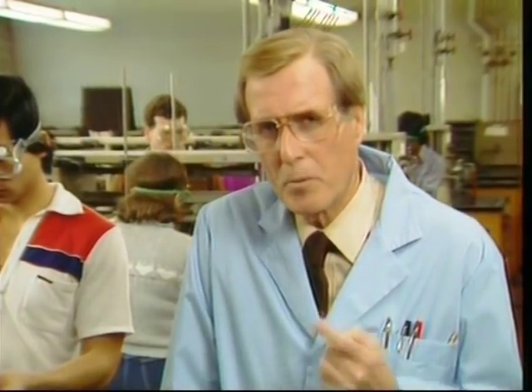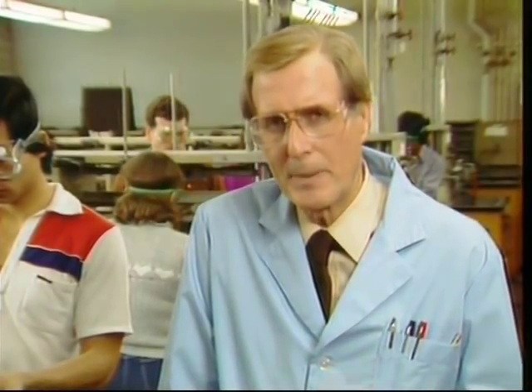Well, the most important thing is not to panic. When an accident occurs, think about what you should do. Then react swiftly, surely, and in a manner that will not cause injury to others. Remember that the lab is a community. There are others there to help you if you have an accident, and you should be prepared to help them. If the instructor is not at the scene of the accident, someone should get him or her immediately while others are helping the injured person.